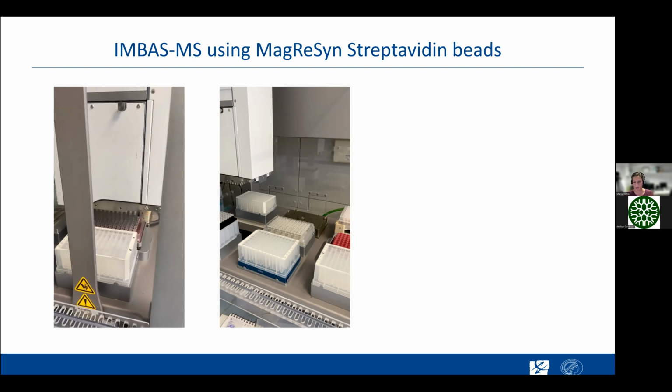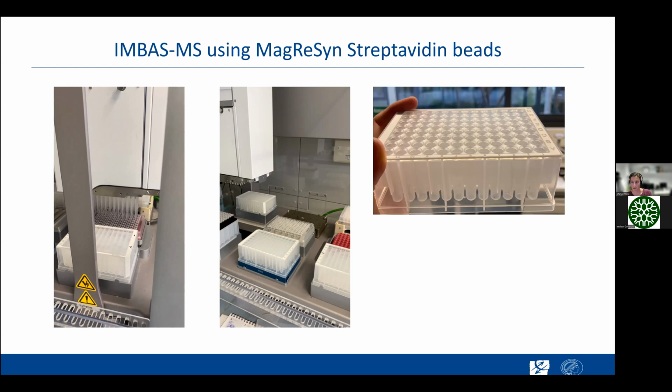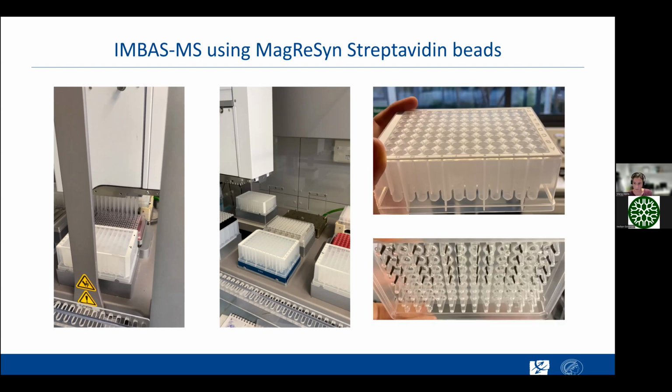And what's really nice with using the beads actually from resin is that we can do it very fast and very clean without really having a lot of bead loss to the tips or bead loss on the plastic. They separate really fast, they separate really nicely, and this allows us also to really do this on this robotic platform because we have a way of doing the enrichment without actually a lot of long incubation steps in between.